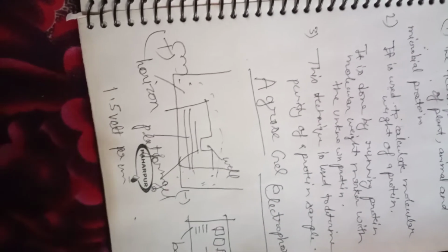After electrophoresis, the DNA is stained with a fluorescent dye, ethidium bromide, and it is observed in ultraviolet light, that is UV light, at 300 nanometer. Ethidium bromide binds between the nucleotide bases and shows orange-red fluorescence, and so DNA bands appear orange in color.